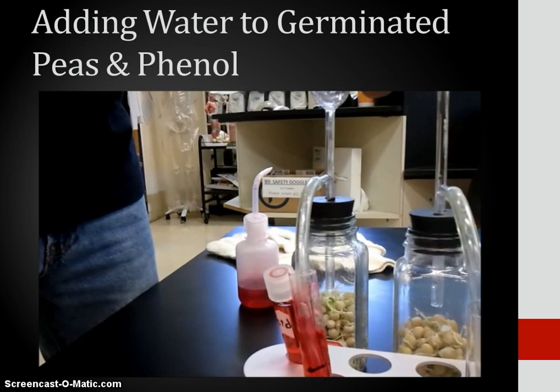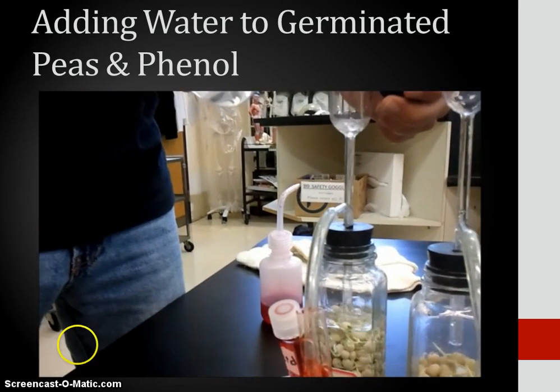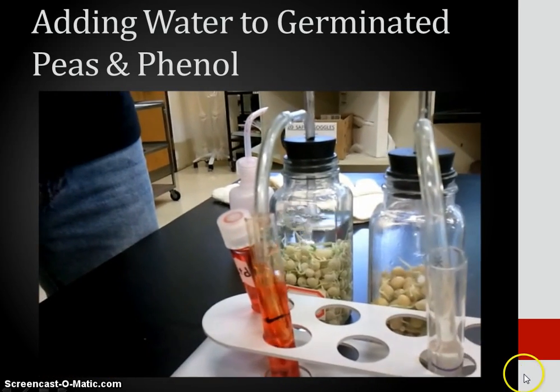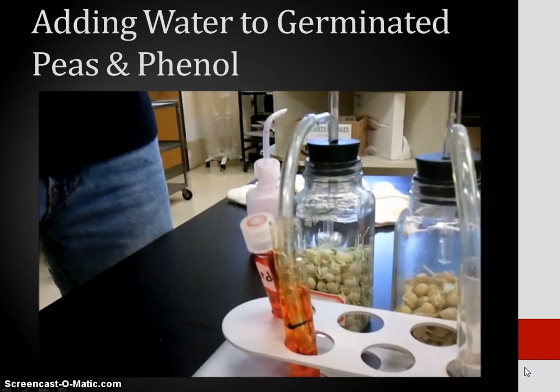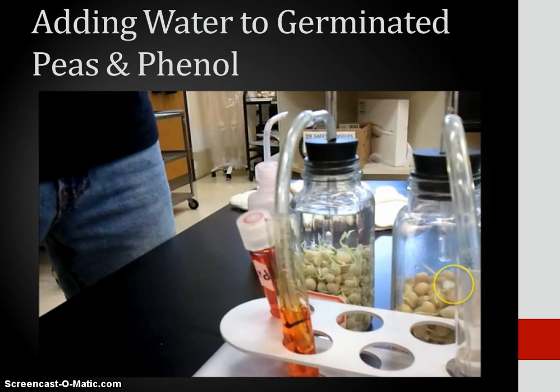Here's a video of Bobby pouring the water into the germinated peas and phenol red, and we can see over here that yes, yellow bubbles and a yellow color is appearing. So what does this mean? This means that carbonic acid is being displaced.